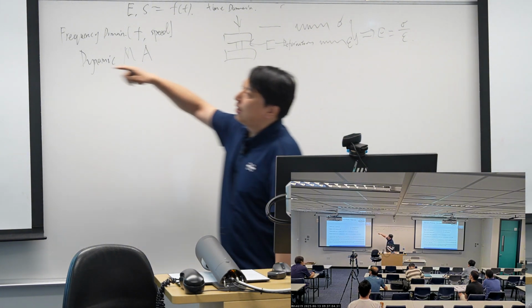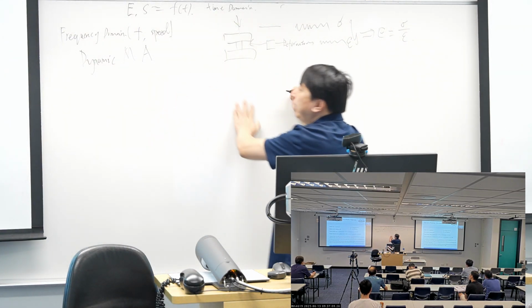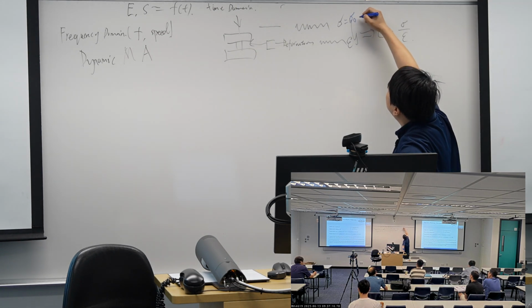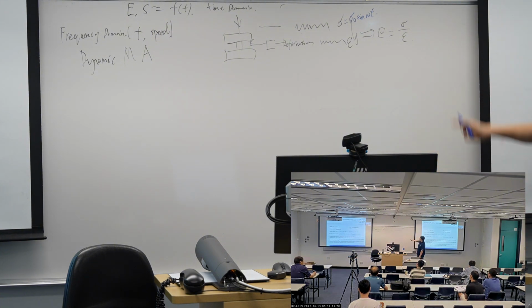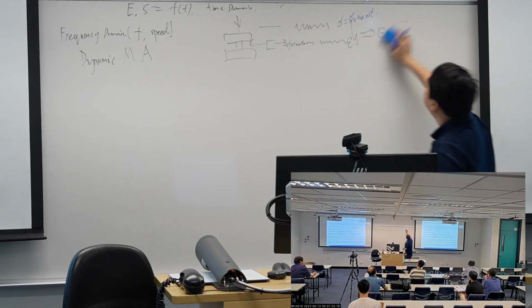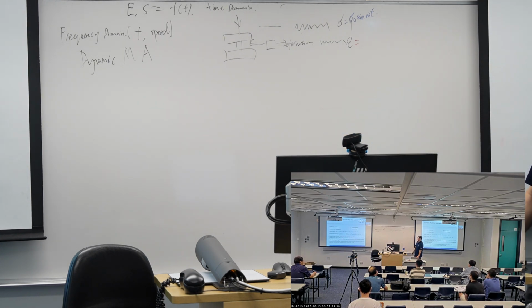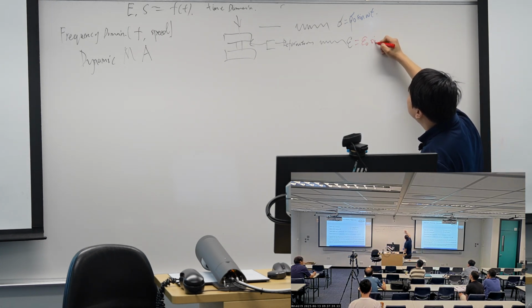So for example, like this left side, we apply our force, or stress, in a sine wave way. And the omega t is defined by ourselves. We define such frequency. And then we measure the deformation. And from the deformation, we get the strain. And the strain should also be a certain wave.